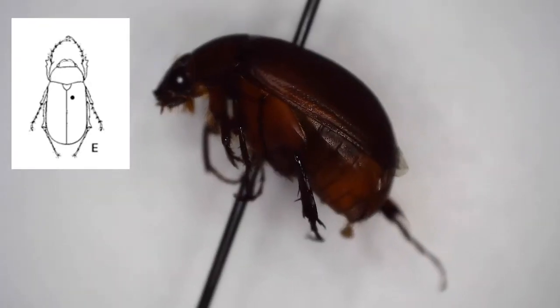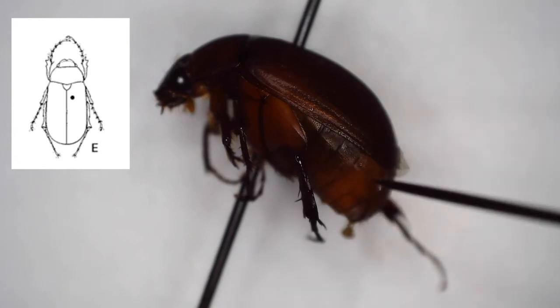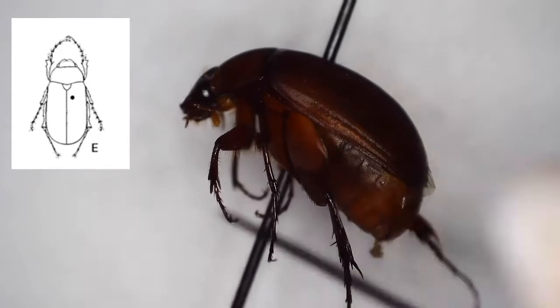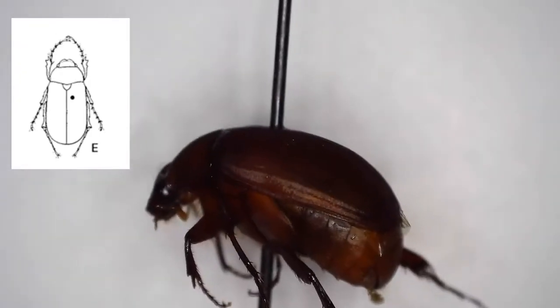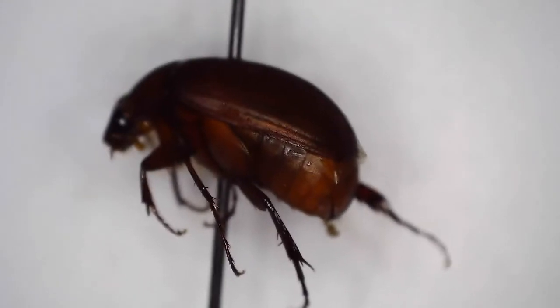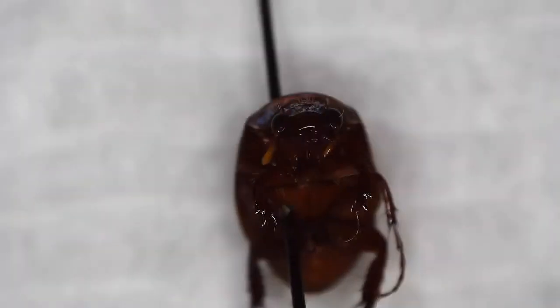So now that it's pinned, I can try to show you some features, but as you can see here, it's slightly too dark with my microscope. I'm using my digital microscope for this video. I'll probably take some photos with my macro camera a little bit later, but I'm showing you some of the standard features of the beetle. You have this heavily armored body with the elytra. Those are the hardened forewings. And now I'm zooming in just to give you a couple of views of this cute little guy.